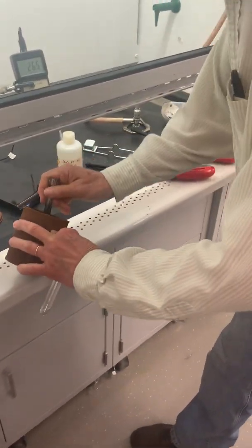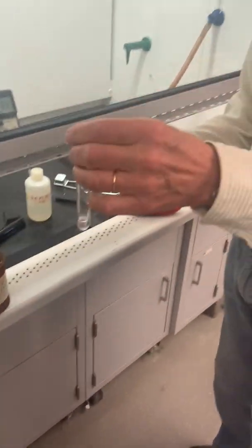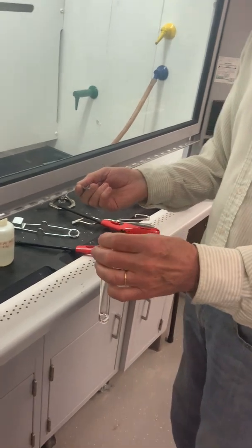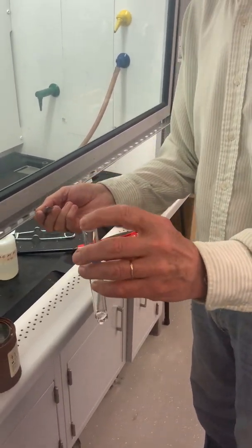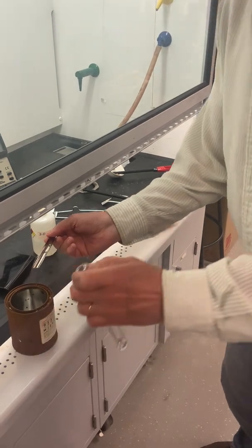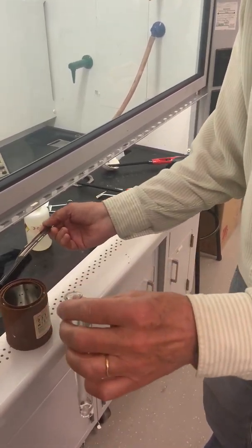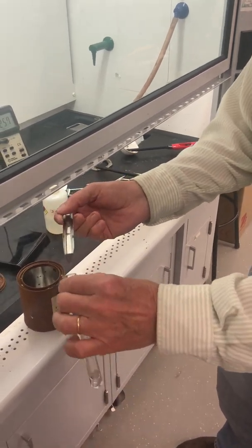Okay. Here comes that magnesium ground up into the HCl. You expect to see the same bubbling, production of the gas. What I'm going to do then is grab that barbecue lighter and hold the flame over the top of the test tube. So if there is that gas, and that gas is reactive with oxygen, we should be able to see and hear that reaction taking place.